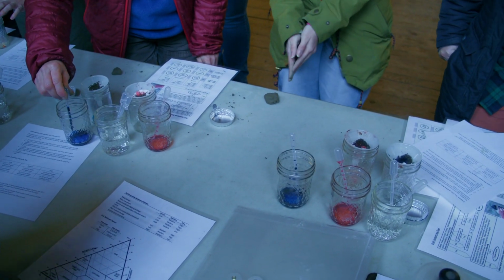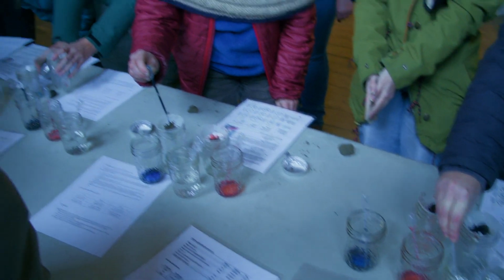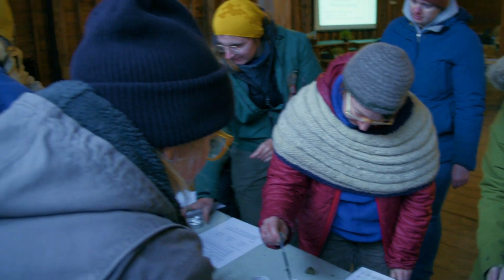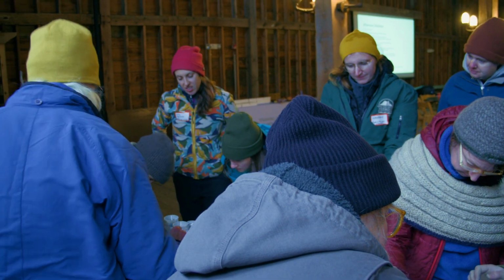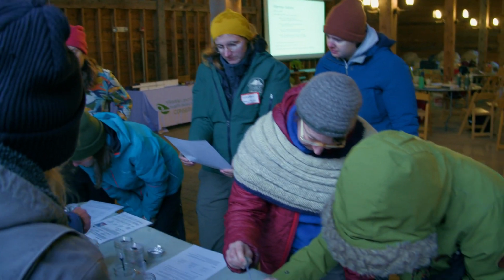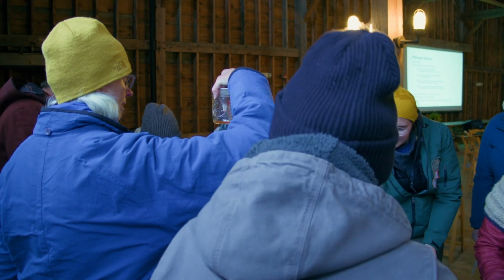And if you look at the color of the dye compared to what's going to come out, you can start seeing how much of that dye is still stuck to the soil. I feel like more blue is still in the soil than red.